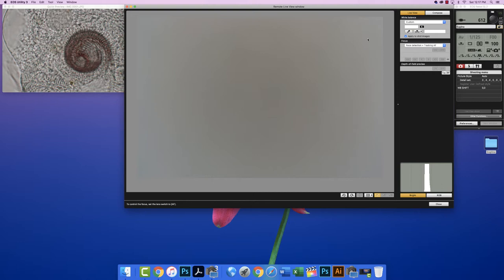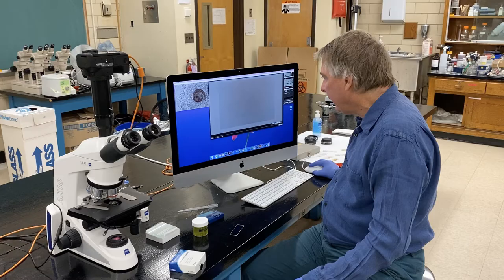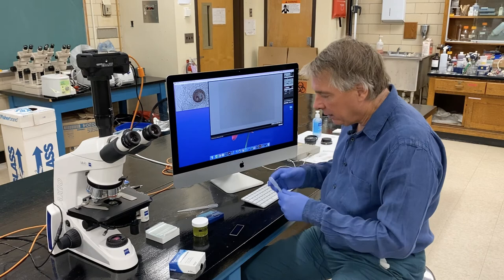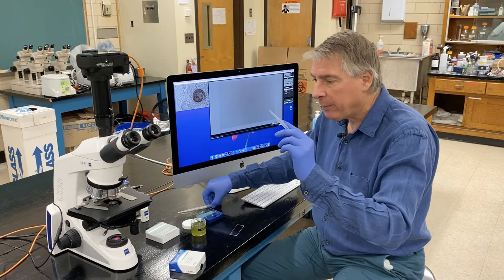And our ISO is again back to 100. The exposure compensation is set back to 0. And I've made a new folder for another organism called Euglena that I'd like to look at now. So any shots that we take now will be in the Euglena folder. And I'm going to take the cover off. I have a new microscope slide, and I'm using a new pipetter. I'm going to save this one for the Stentor sample if we want to look at that again.